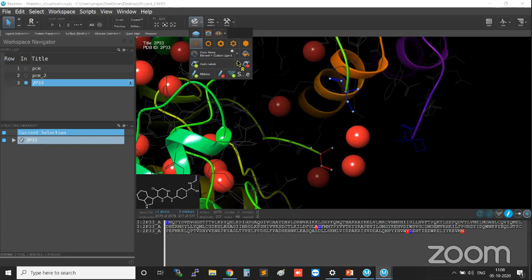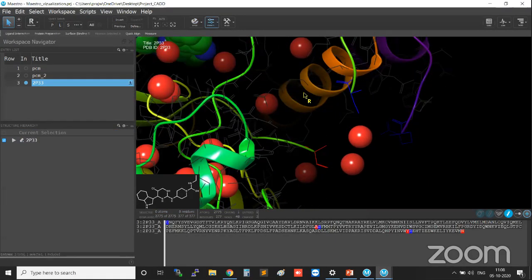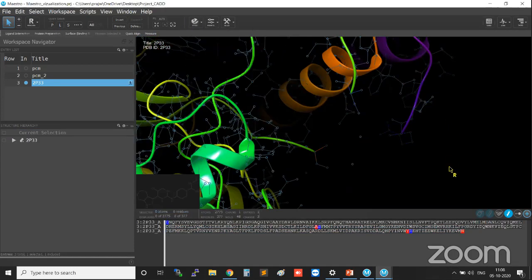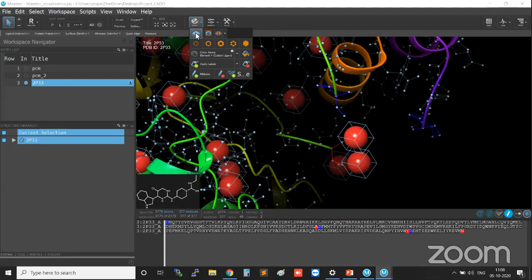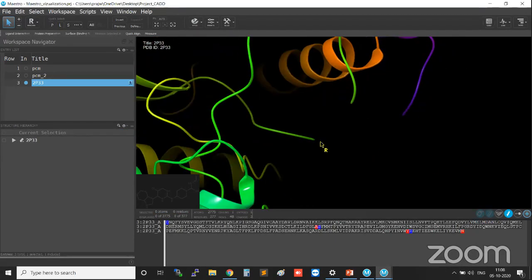Like for example, you can see here there is a non-continuation between the amino acid residues. So I just hide all those lines. Using this I button, I can show and hide the lines. You can see here for the complete protein structure, and you can see this green color. This part is particularly missing, so the same thing is also mentioned here. So these are the amino acid residues which have a missing link.